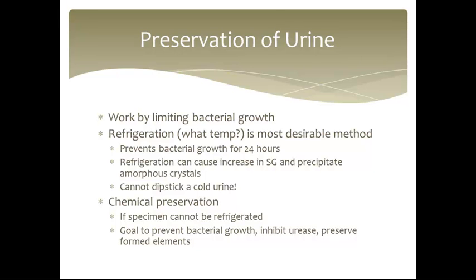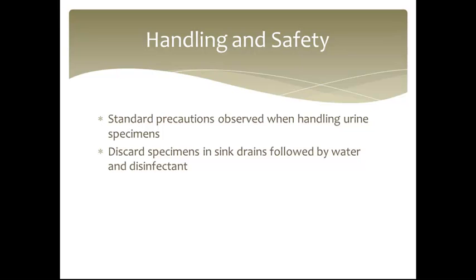Chemical preservation. If a specimen cannot be refrigerated, the goal is to prevent bacterial growth, inhibit urease, and preserve formed elements. Standard precautions are observed when handling urine specimens. Discarded specimens go in the sink drain, followed by water and a disinfectant.